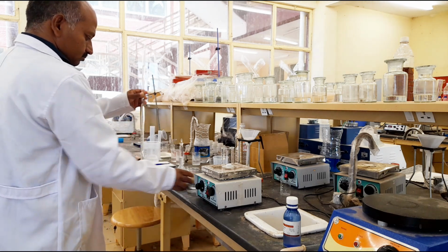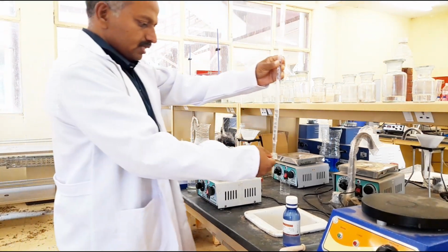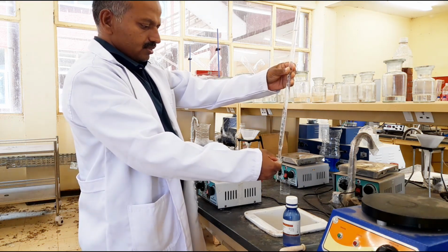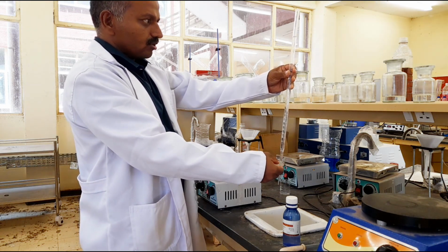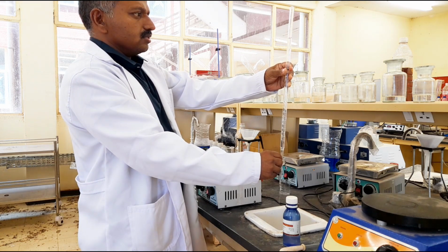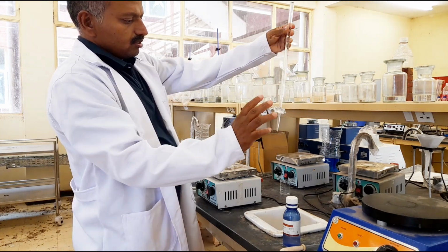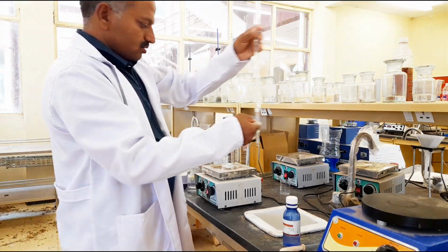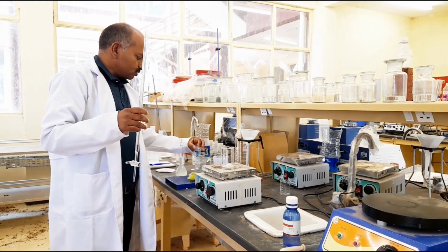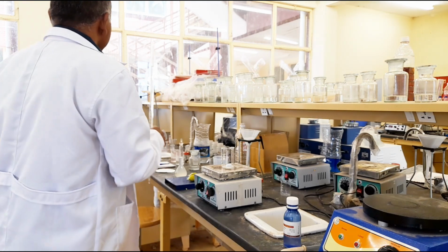Yes. So this is above the mark. So I will release some amount of sodium hydroxide down to remove the air bubbles at the bottom. Now this is perfect. The mark is correct, and now there are no air bubbles, so I can use this. This is the burette containing sodium hydroxide base, and now I will keep it aside.